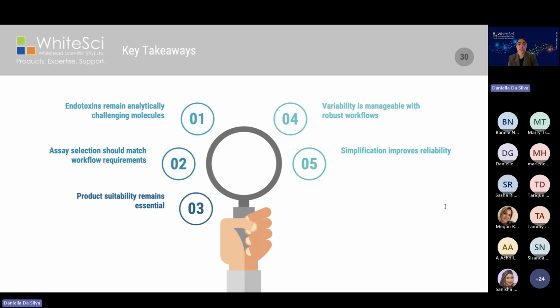human error. If there's one message I'd like you to take away from today's webinar, it's this. Reliable endotoxin results depend on reliable workflows. The ultimate goal is not simply to generate data, but to generate results that are accurate, reproducible, and scientifically defensible, results that laboratories can trust with confidence.